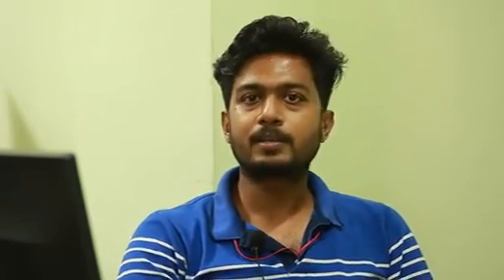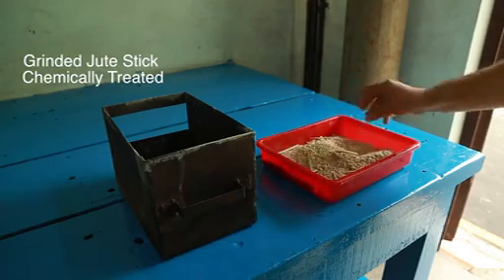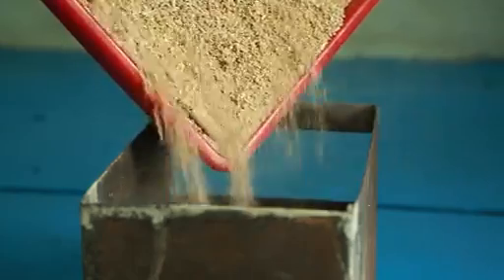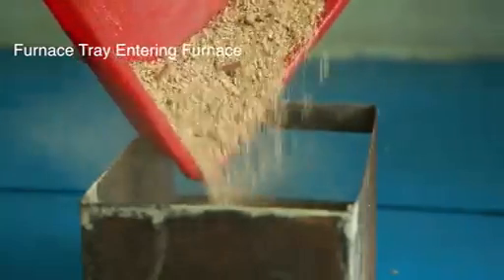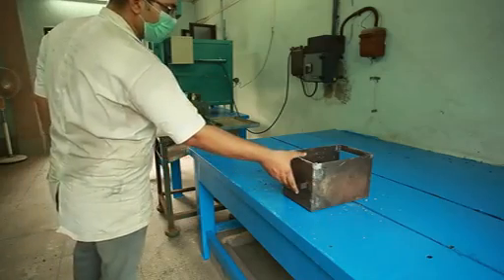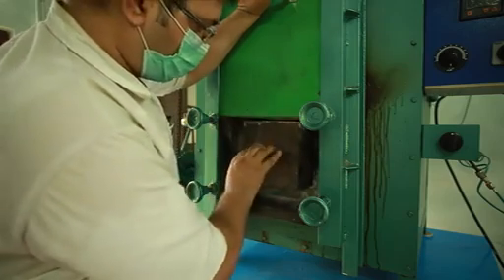In short, what we are doing at ICAR NINFET: we are taking jute sticks, making them clean, and those clean jute sticks are further processed for chemical activation. Yes, we are preparing activated carbon from jute stick by a chemical activation process. Now we are keeping the chemically treated jute stick particles into the muffle furnace.